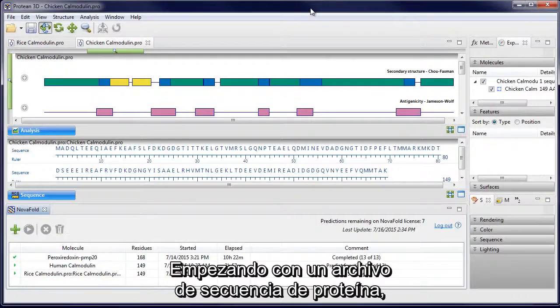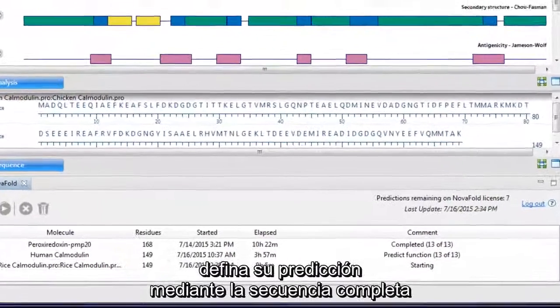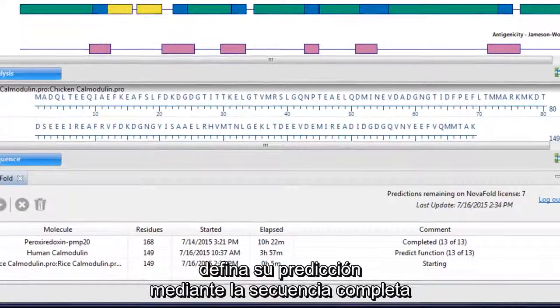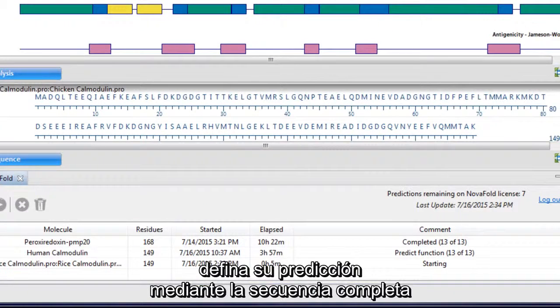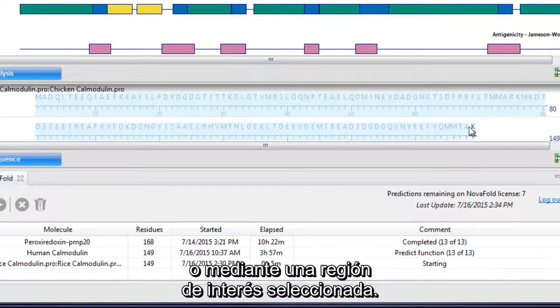Starting with a protein sequence file, set up your prediction using the entire sequence or a selected region of interest.